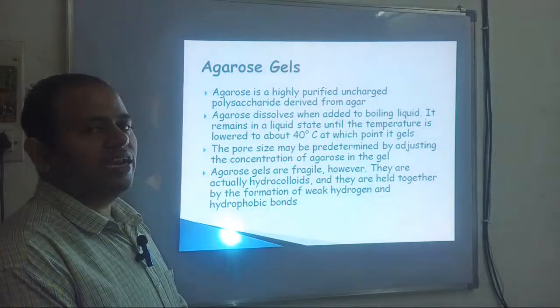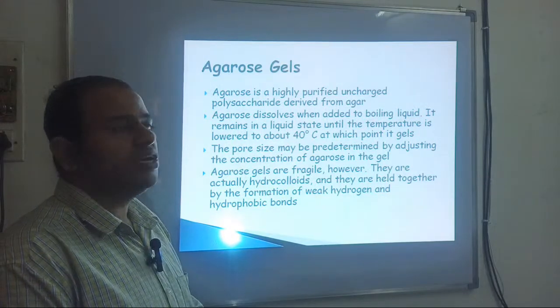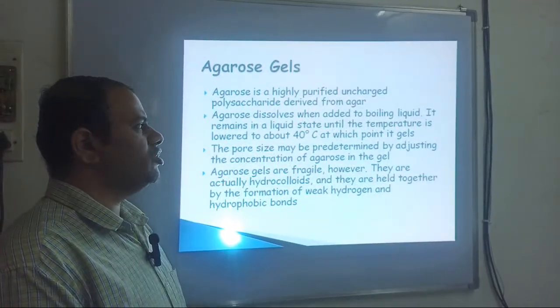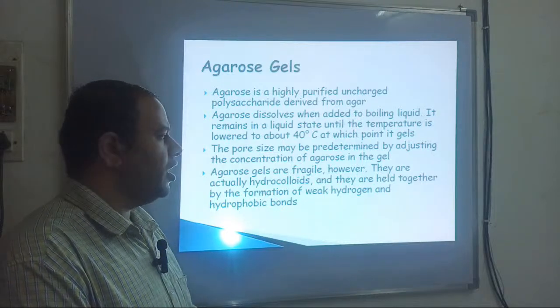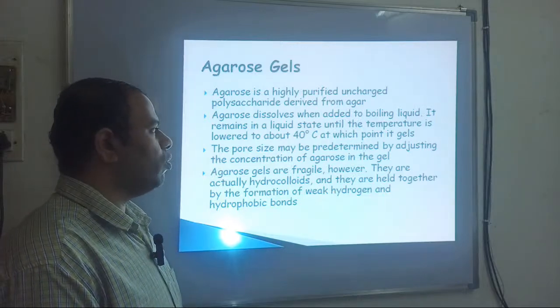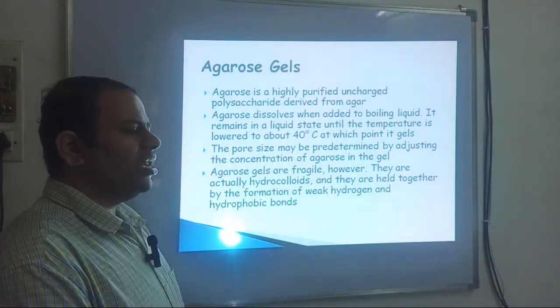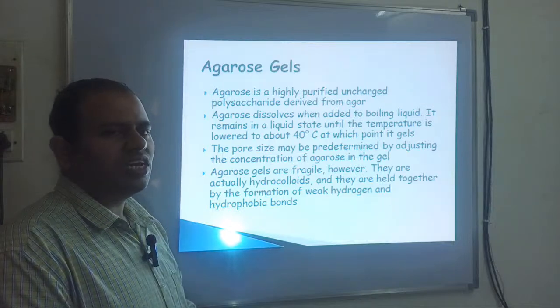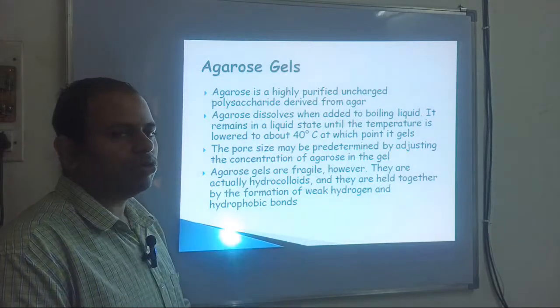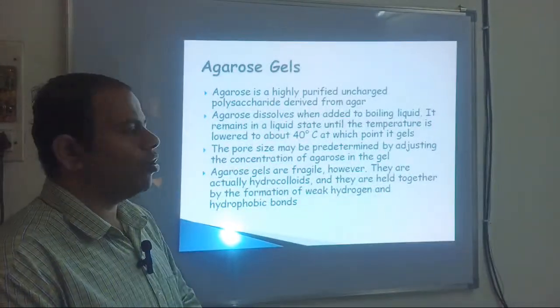So what is agarose? First, let's see. Agarose is a highly purified polysaccharide. Agar agar is a polysaccharide from which the agarose is isolated. It is isolated from a red algae, Rhodophyceae. The name of the algae is Gelidium corneum. This is an algae from which the agarose is isolated. The melting temperature can be as low as 40 degrees Celsius. Generally, the agarose gel that is used for educational institutes has a melting temperature of 52 degrees Celsius. But low melting agarose is also required for very specific applications in which DNA has to be recovered from the gel.